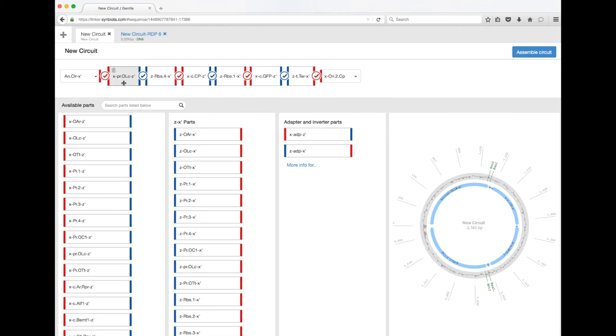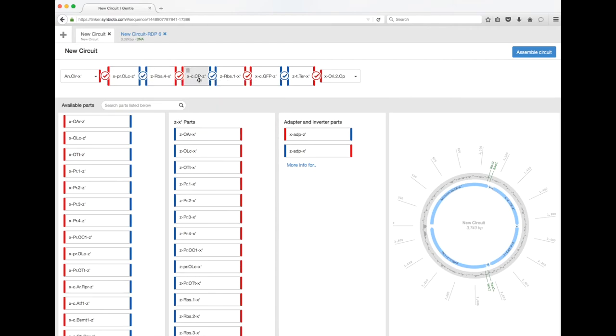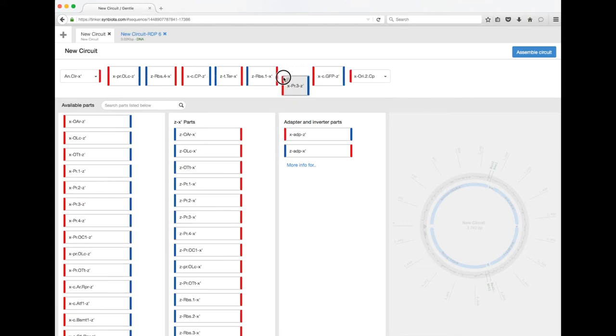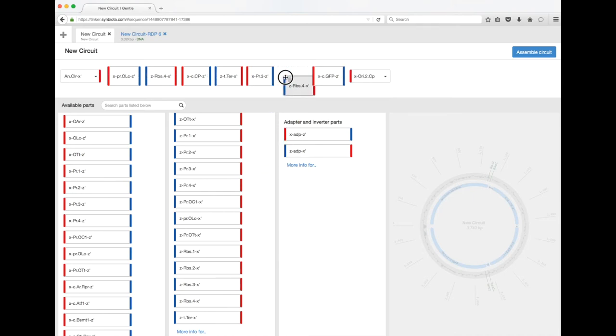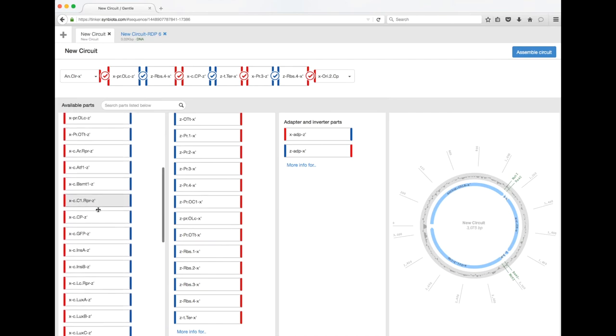This is some of the fun stuff you can do. Now that we've got the lac operator and a ribosomal binding site for the blue chromoprotein, we can put a terminator at the end to insulate that circuit. Then we can have another promoter that's always on, with a high-strength RBS, and then place the coding sequence for LacI there.